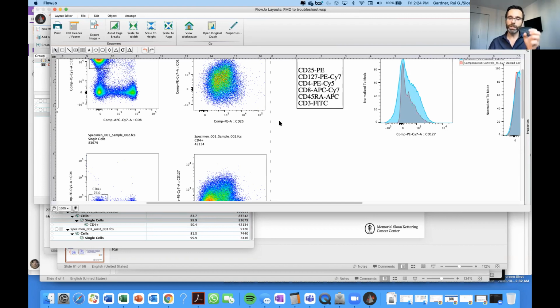If they show an improvement, it means that fluorochrome that you didn't add is at least one of the culprits, right? You could have several of them. And so again, this will help you to start identifying which are the fluorochromes that are really not the best choices. So again, a nice strategy. And like I said, if you do this systematically for all of the channels, you might really be able to troubleshoot this very quickly. And this works just the same for full spectrum flow cytometry, right? But instead of talking about channels, we were talking about fluorochromes, right?